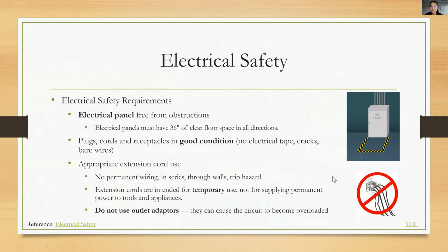So next one is the electrical safety. Shortly, the electrical panels should be free from obstructions, and no outlet adapters should be used.